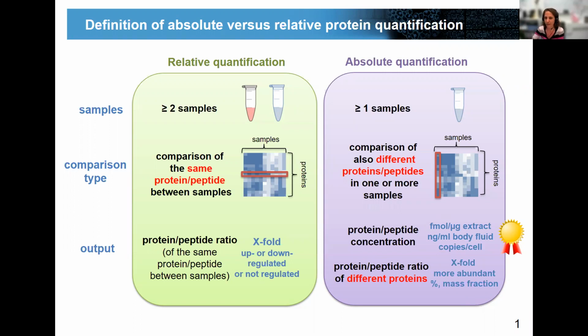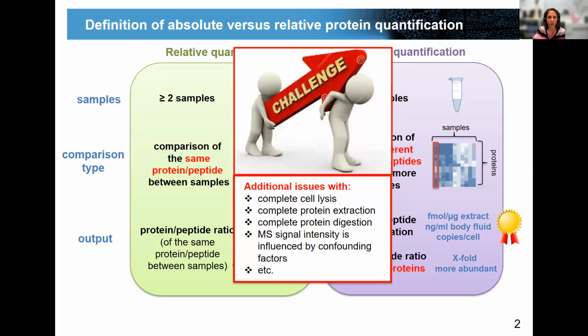Okay, so the challenge to do relative versus absolute quantification is not the same. Actually, doing accurate relative quantification is easier than doing accurate absolute quantification, because there is a number of issues that are much more influencing absolute than relative quant.